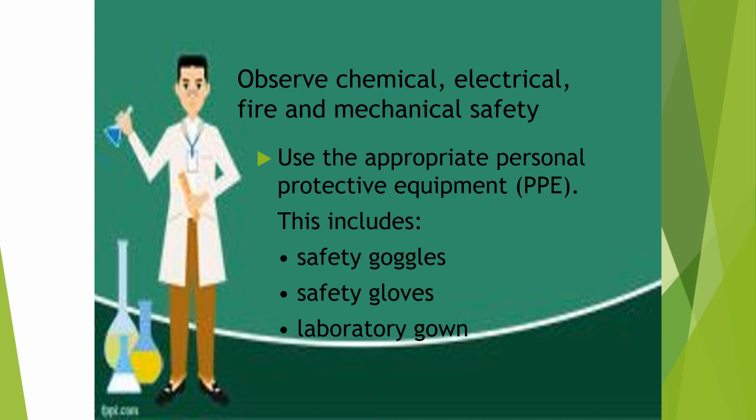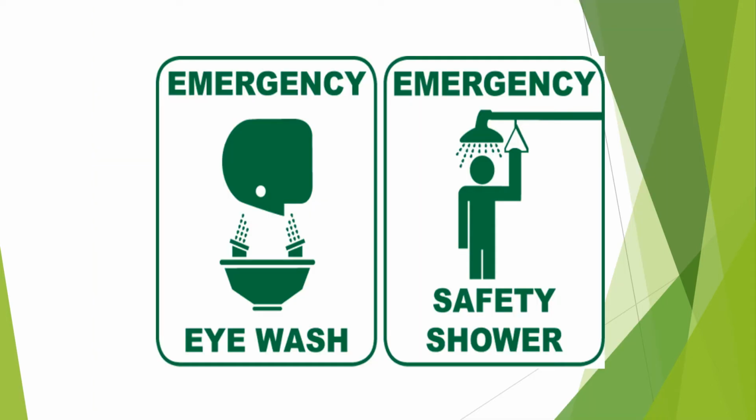Of course, as I mentioned earlier, the personal protective equipment is very important. Installation of emergency eye wash and emergency safety shower is also very important for you to have in a science lab in case of emergency.